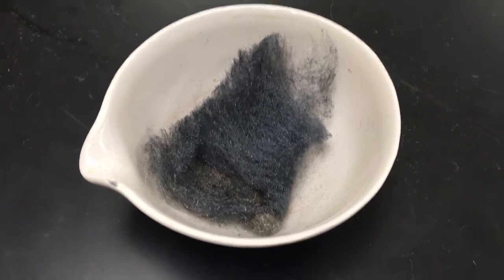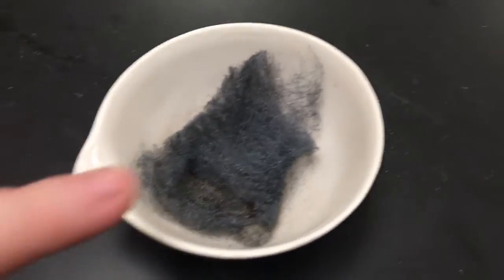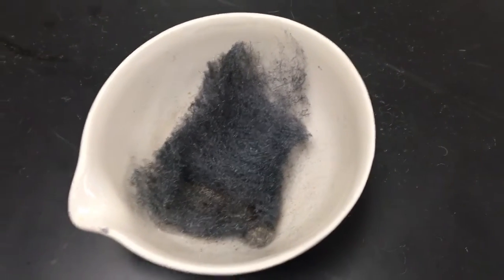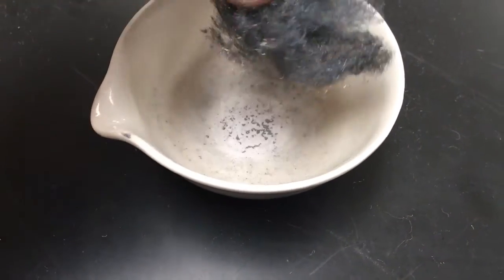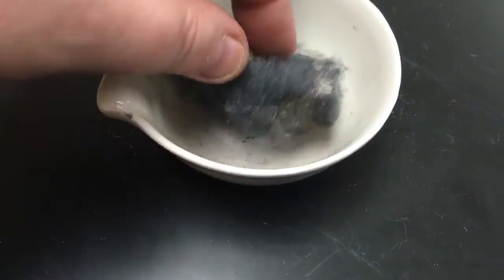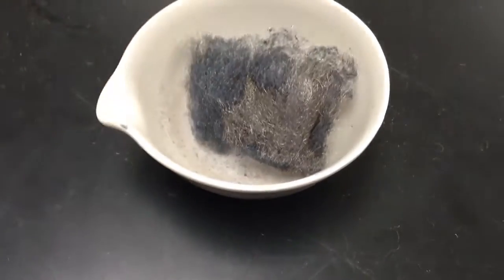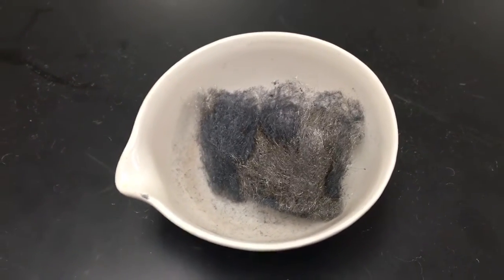Finally it stopped. I was kind of expecting that it would come over here. You can kind of see some of the original iron left over. It's just a slightly different color than the rest of this. You might see more if I flip it over. I'll flip it so you can see that contrast, kind of a before-after look all together here.